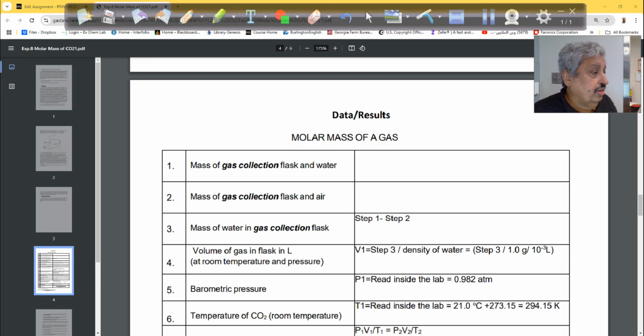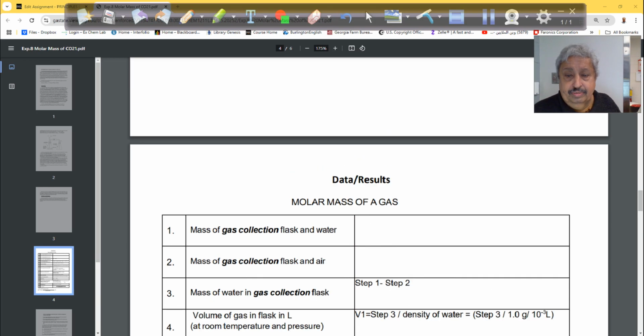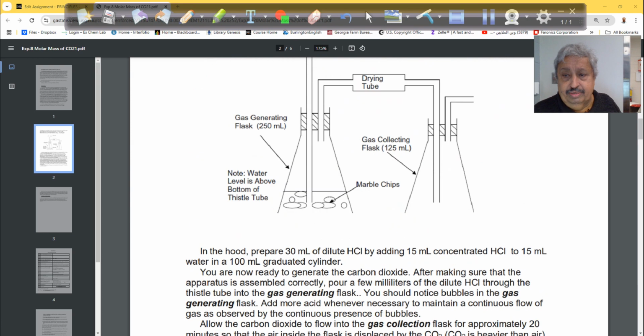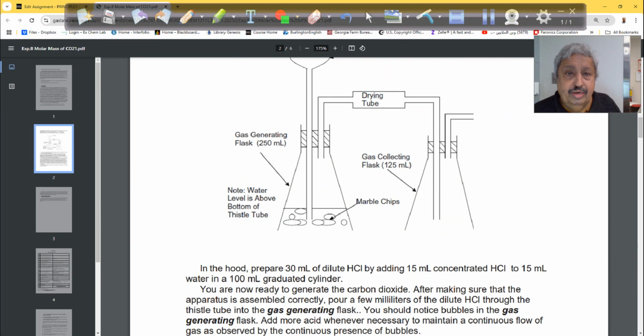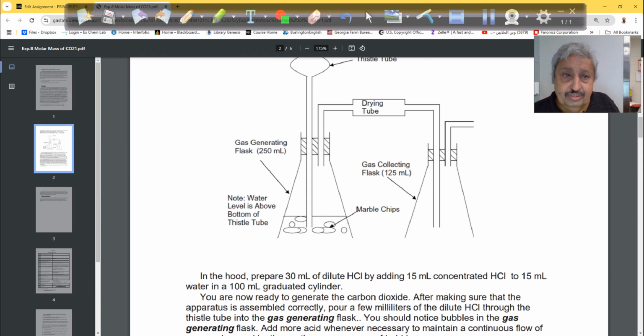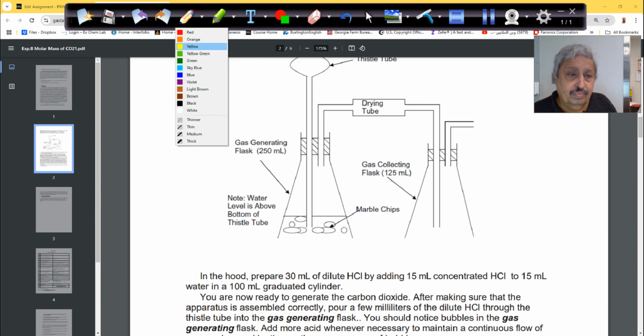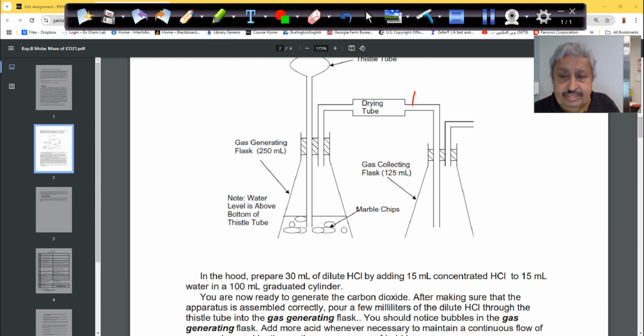The two tubes, you take, maybe I have to put here, look, those two tubes here, this one here, don't take the drying agent. You see the drying agent there? Can you see the drying agent from here? This is the first tubing here, and this is the second one. So here it is.